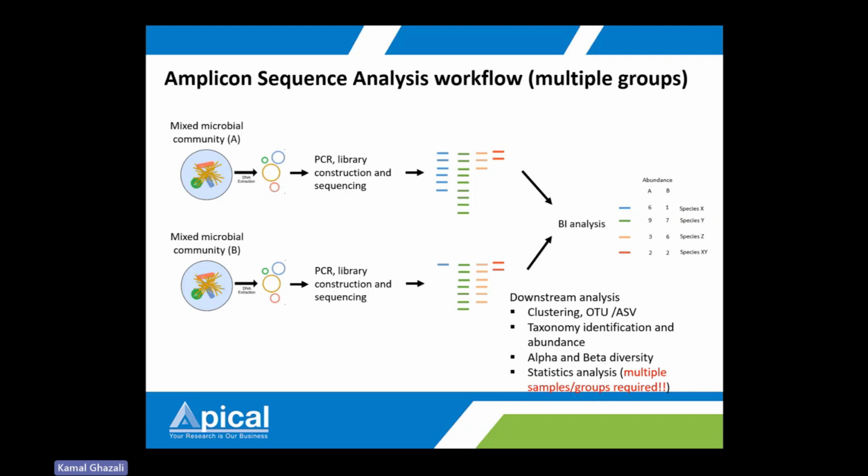This is just an example of multiple groups. There are many types of groups. As long as they are different types of samples, we can use this approach to understand the difference from one group to another, using the same workflow as I mentioned. The samples will go through the same process.